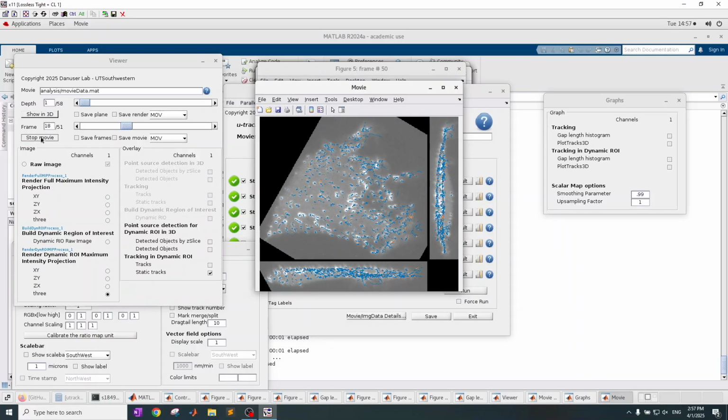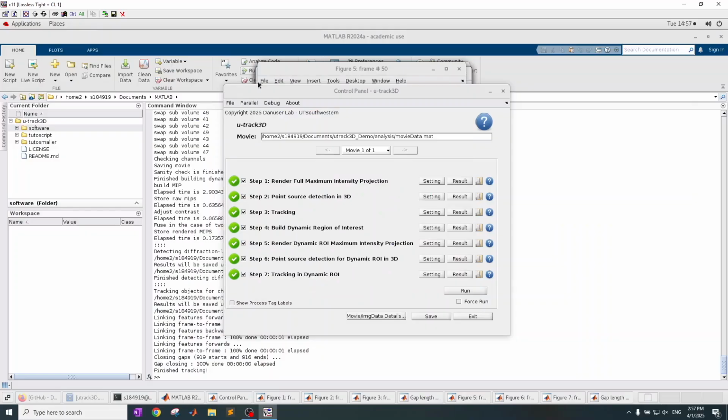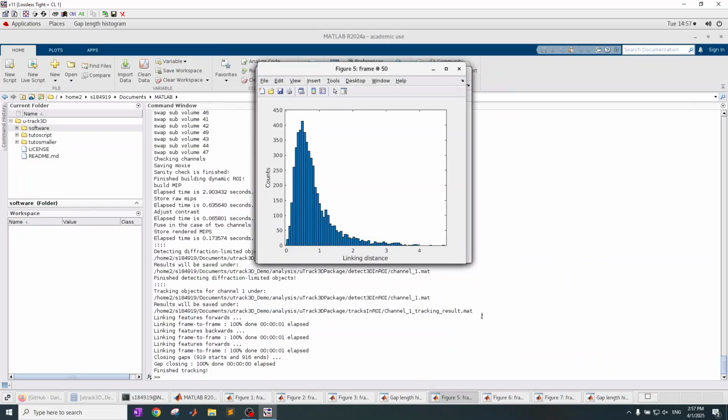You can go back and click on the results from each step. It's a good idea to check the results between running each step. You can also change the parameters of a previous step and rerun the package again. To exit the package, click Exit, or simply close the window.